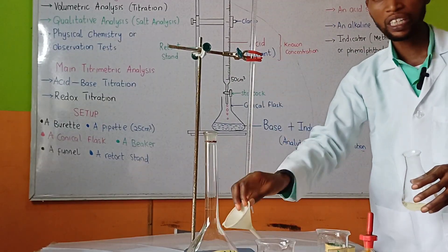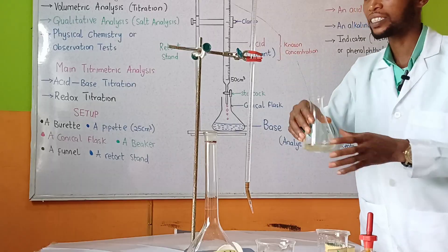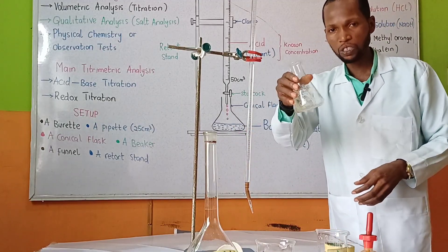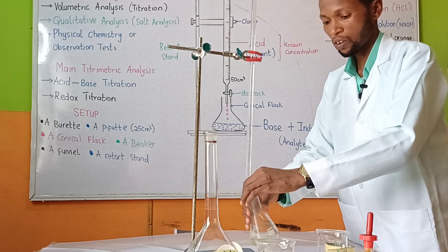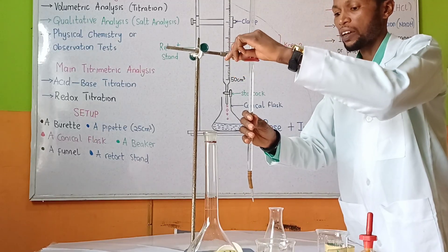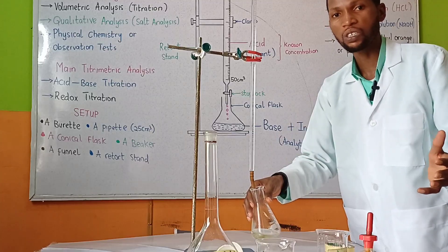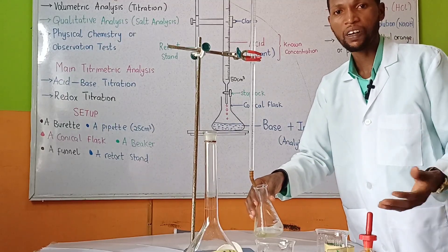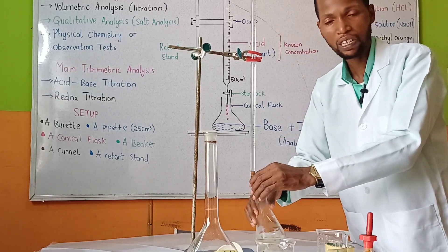Remove the funnel before you start titrating so that no extra drops fall into the solution in the burette. We can now kick-start our titration — the titrant is the hydrochloric acid in the burette, and the analyte is the sodium hydroxide in the conical flask. Continue adding acid from the burette into the conical flask until you observe a color change. At first you will observe the appearance and disappearance of a light pink color as you add the acid.